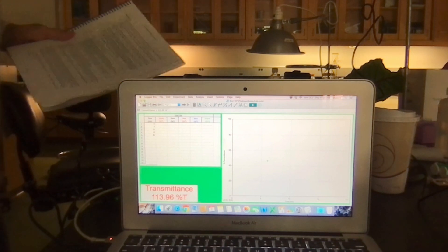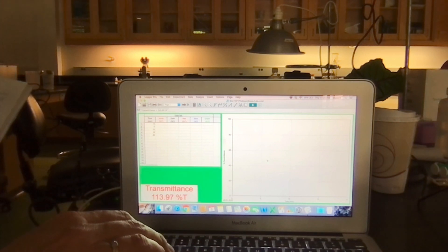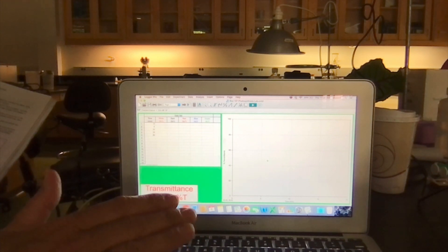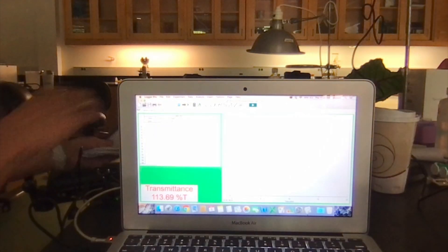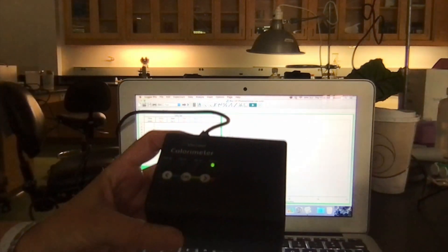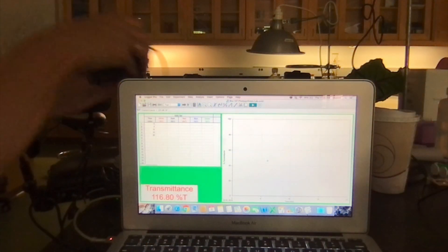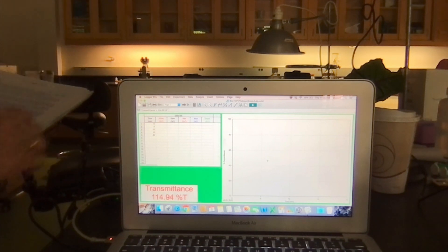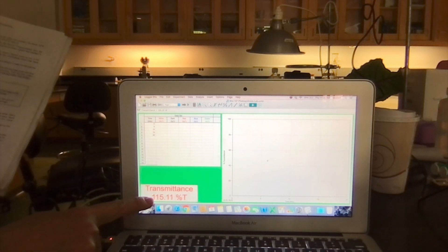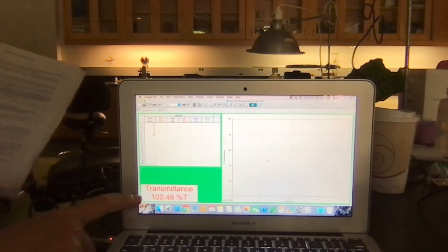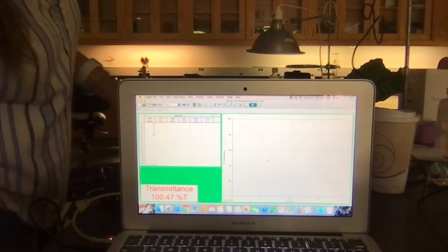Once I have the blank in my colorimeter, I'm on step five now on page 59. Put the cuvette in the colorimeter. I did that. I put it so the sides are the right way. It says check that the wavelength is set to 635 on this box here. Where the green light is, it actually says 635. Then it says you're going to push the CAL button on that black box, which I did. You'll see that this transmittance value goes to about 100. And that's what you want. 100% transmittance. So we just blanked. That was called blanking our colorimeter.